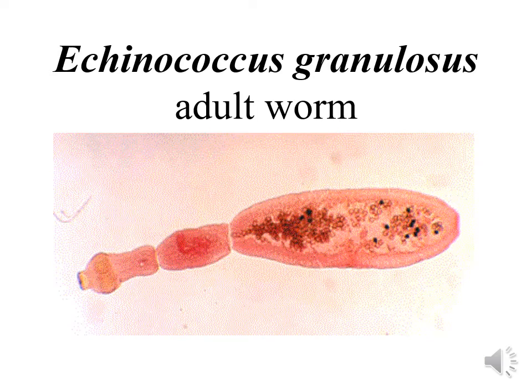It has a scolex with 4 suckers and rostellum with hooks, then a segment which is young, a segment where you see male and female reproductive systems. This is the mature one, and in the last one, usually the male and female reproductive systems disintegrate, and the uterus will enlarge to fill almost the whole segment, full of eggs.